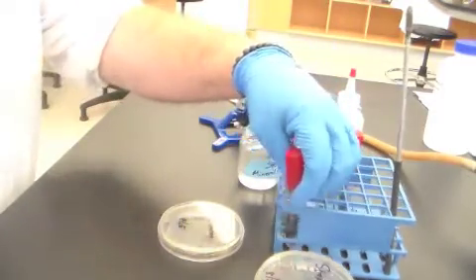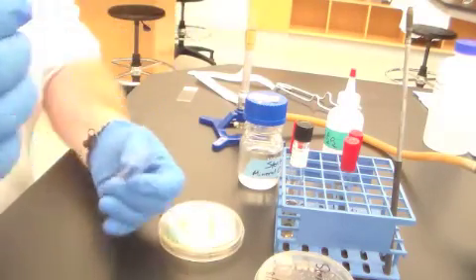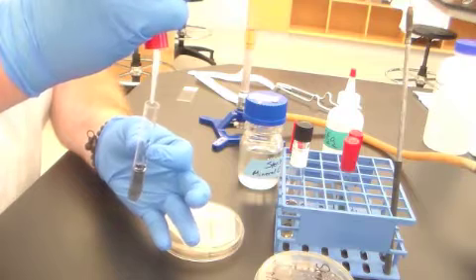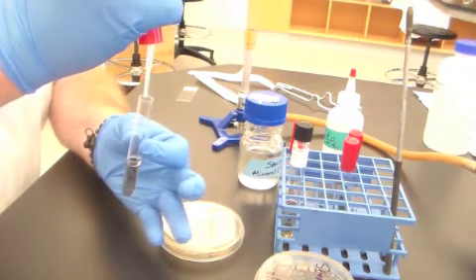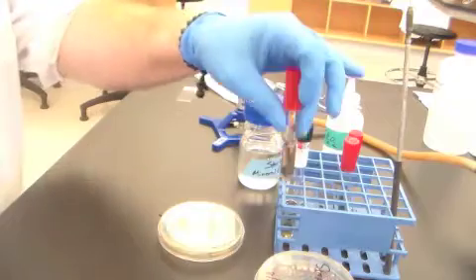You want to make certain that you do the same thing for the ornithine. Again, I don't know if I flamed that last one, so I may not have used the best sterile technique. But I'm just going to add 10 or 15, maybe 20 drops. There's no set volume. You don't need a huge amount. You just need enough so that you have a vapor barrier over that.